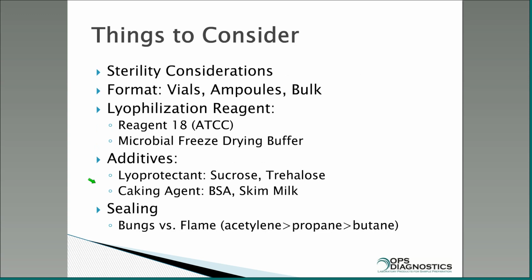So some things to consider when setting up: obviously there are sterility concerns, and there are different views on this. If I'm setting up a bunch of vials that are just going to be stock cultures, which I'm going to use down the road, whether it's a yeast or an E. coli, I would probably be less concerned about sterility than if I'm making vials or ampoules which would be used as a starter culture for some kind of fermentation process.